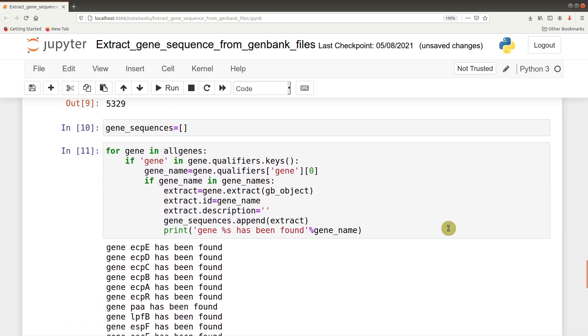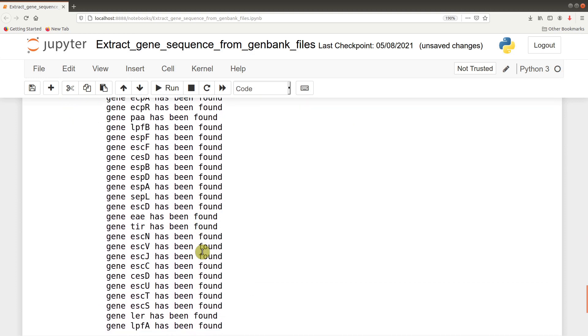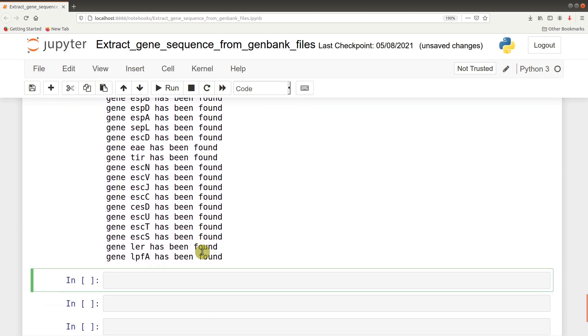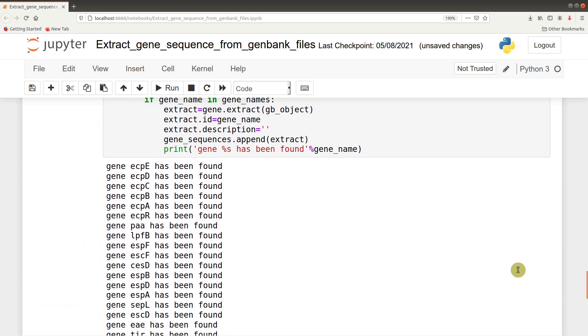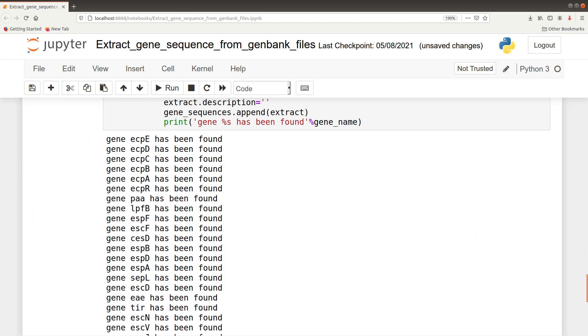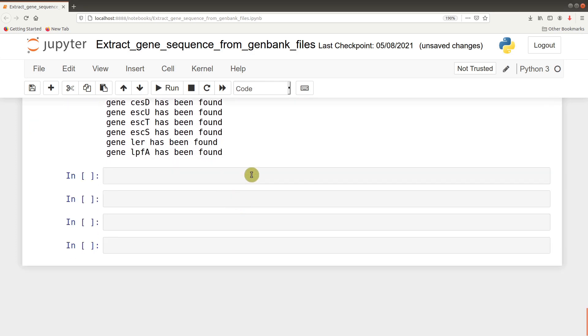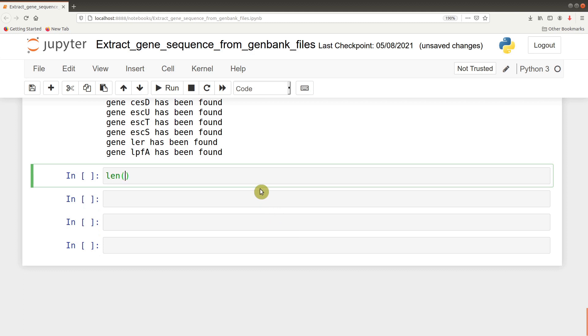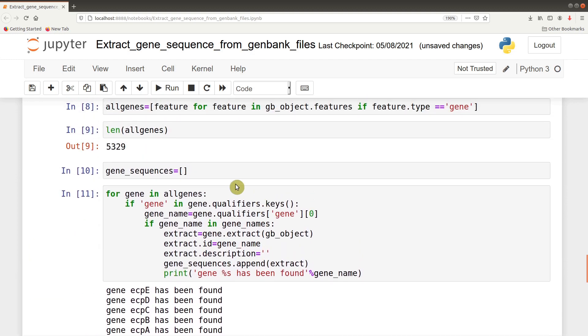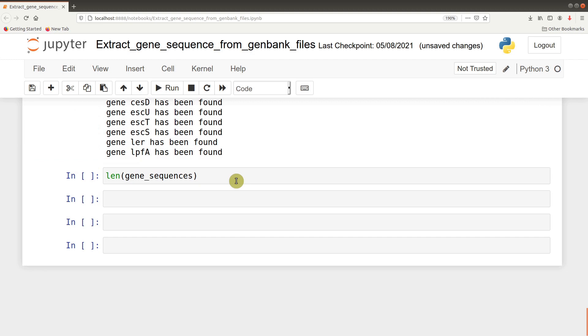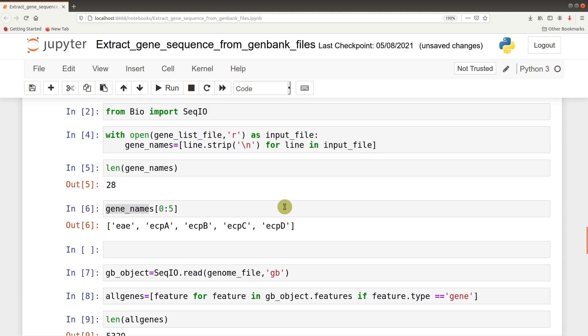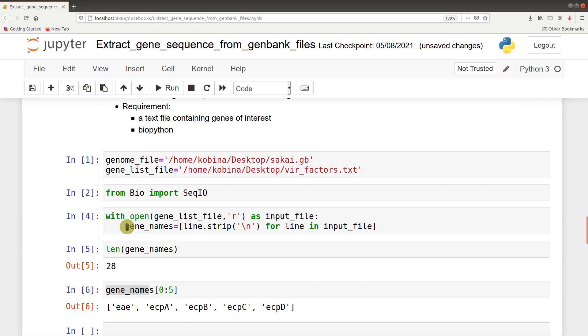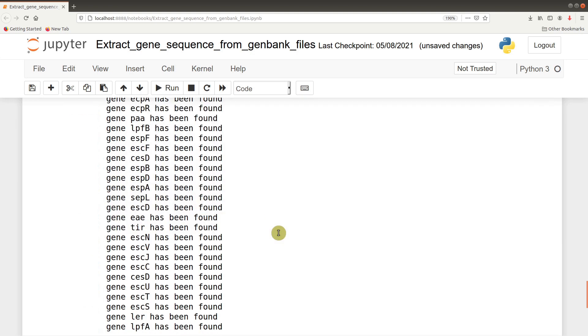The code has been run and notice this information has been printed for each of them, indicating that they were all found. We can quickly check the length of this list we created, the one which has all the sequences there. We say len(gene_sequences), and it gives us 20, which is the same as the gene list we read. So we are good to go.